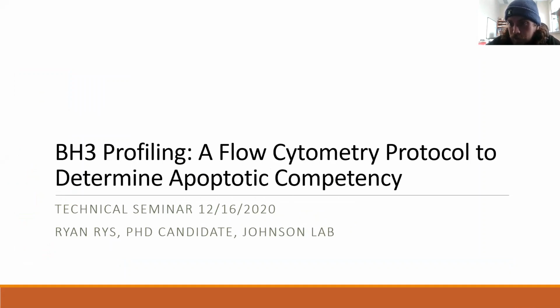Yeah, today we're talking about BH3 profiling, which is a technique I've used a lot over the past year, which has been basically adapted into a flow cytometry, high throughput protocol, and we use it to assess how the apoptotic machinery in cells is operating and whether as a whole the pathway is functional or not.